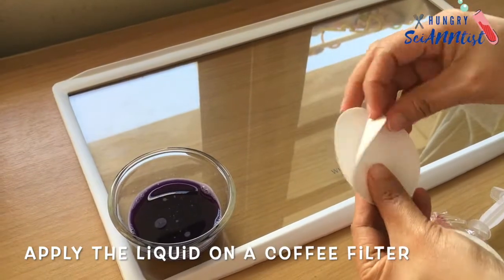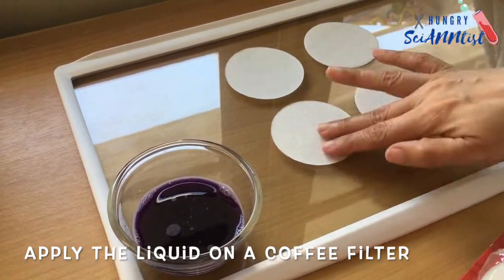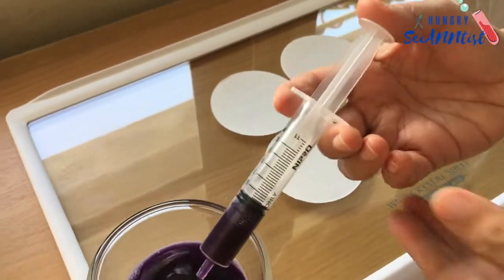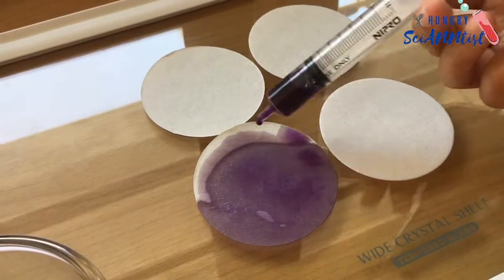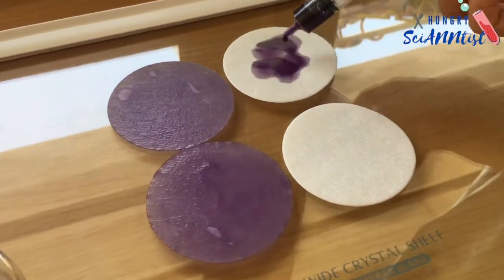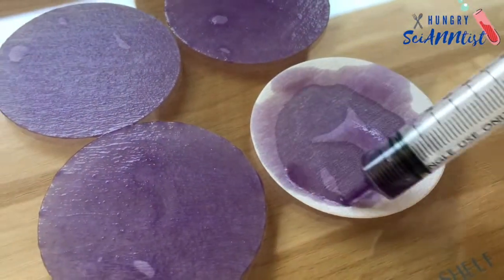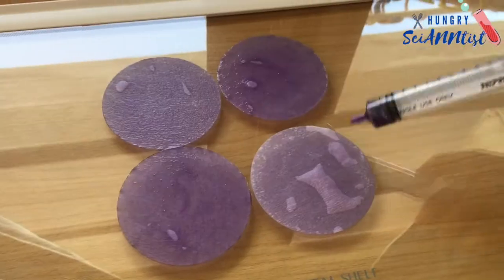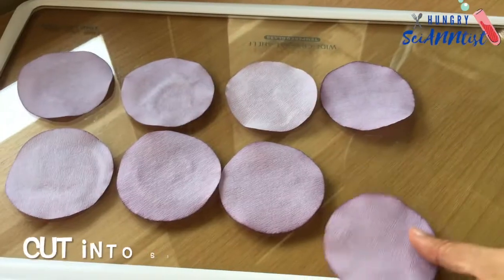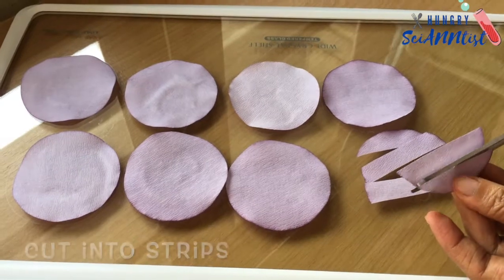Next, apply the liquid on a coffee filter. You can use a dropper or a syringe. Let it dry. Once dried completely, cut it into strips.